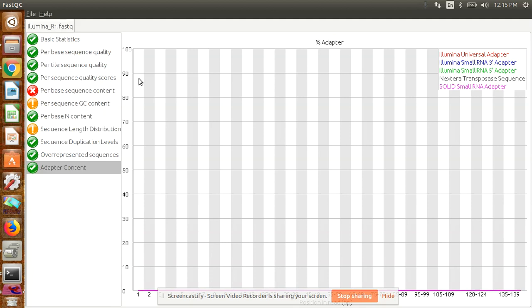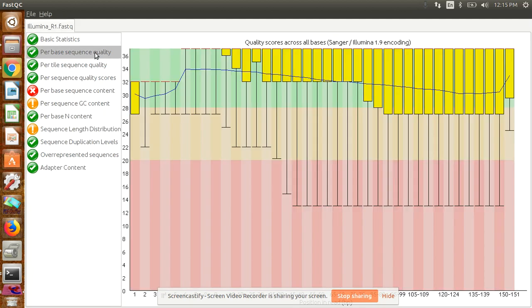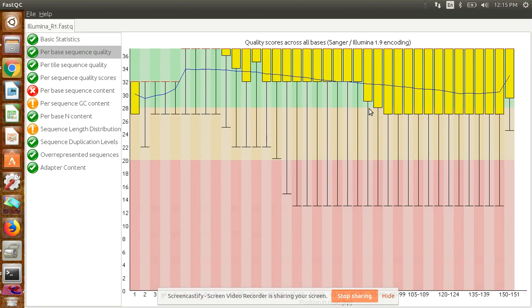The most important parameter is the per-base quality—it should be more than 20. Somewhat can fall in the yellow region, most should fall in the green region, and no sequence should fall in the red region. Then your sequence quality is good. This blue line is giving the mean of sequence quality. It must fall in the green region, then you can consider your sequencing is good. If not good, you ask the sequencer for resequencing.